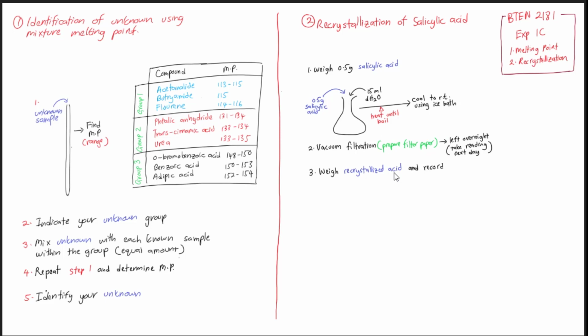Along the way during the experiment later on, I will discuss it, because here I cannot write on this as I didn't bring the pen. Normally I just write here so it's easy for you to see. But I will explain a little bit further during the experiment. If you have a question during the experiment later on, feel free to interject.